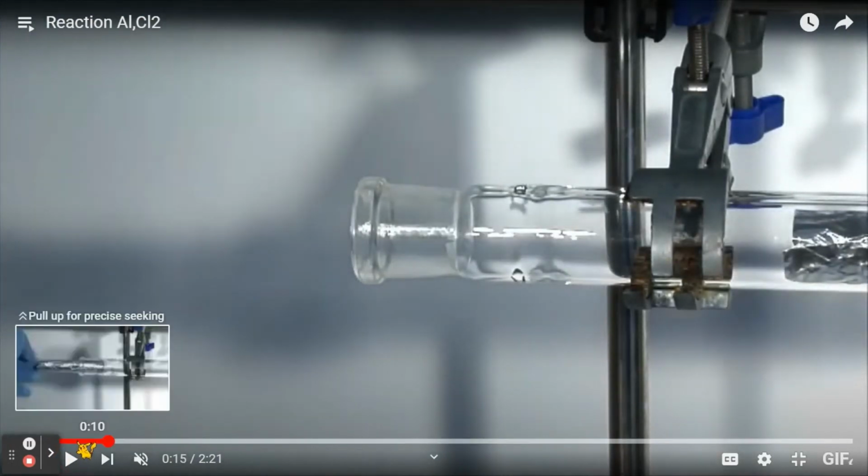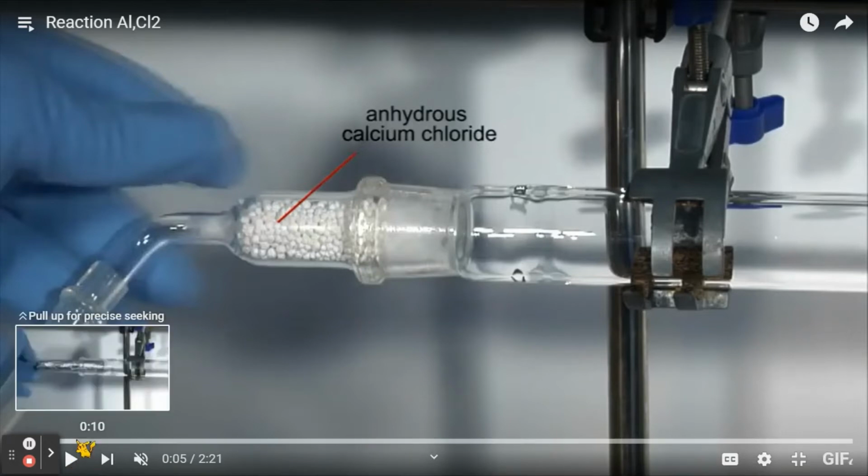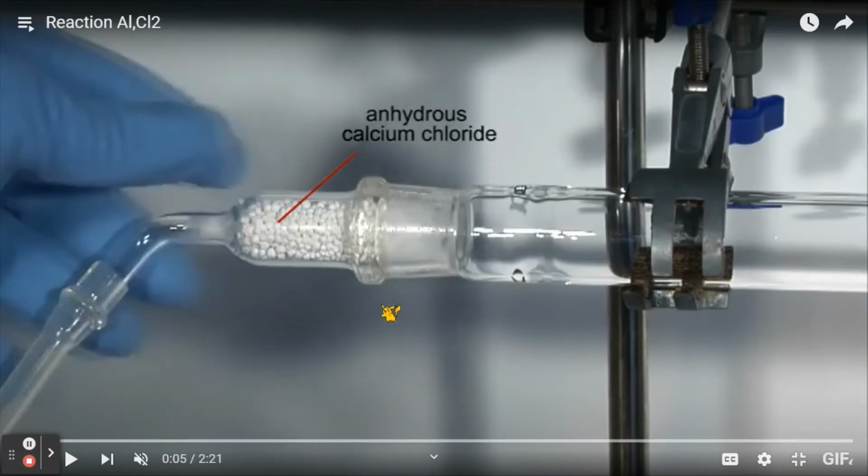They've actually made sure that everything is dry, and the reason why is because the aluminium chloride that you form will actually react with water in contact with water. So you do want to have fully dry apparatus. What they've done is, before they actually add the chlorine, they've drawn air through, and they've used anhydrous calcium chloride to dry that air. So you can imagine that air is coming through here before the experiment is actually conducted.